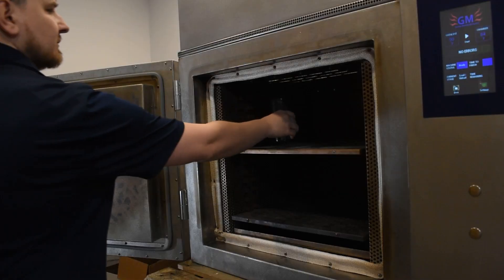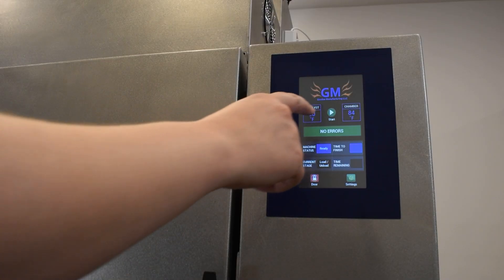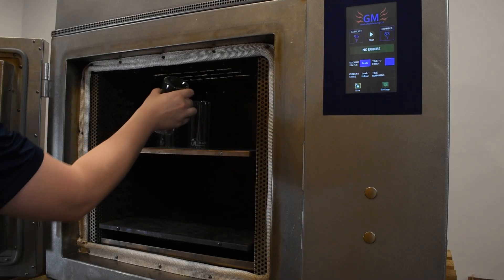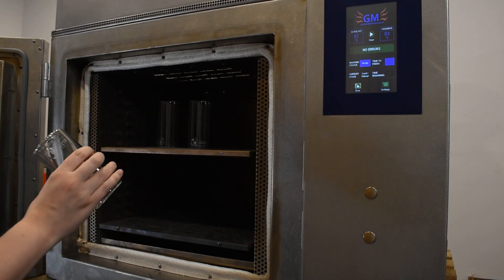Let me show you how it works. Glassware goes in here. You press the green star button, you wait for the cleaning cycle to finish, and then you pull out clean glassware.